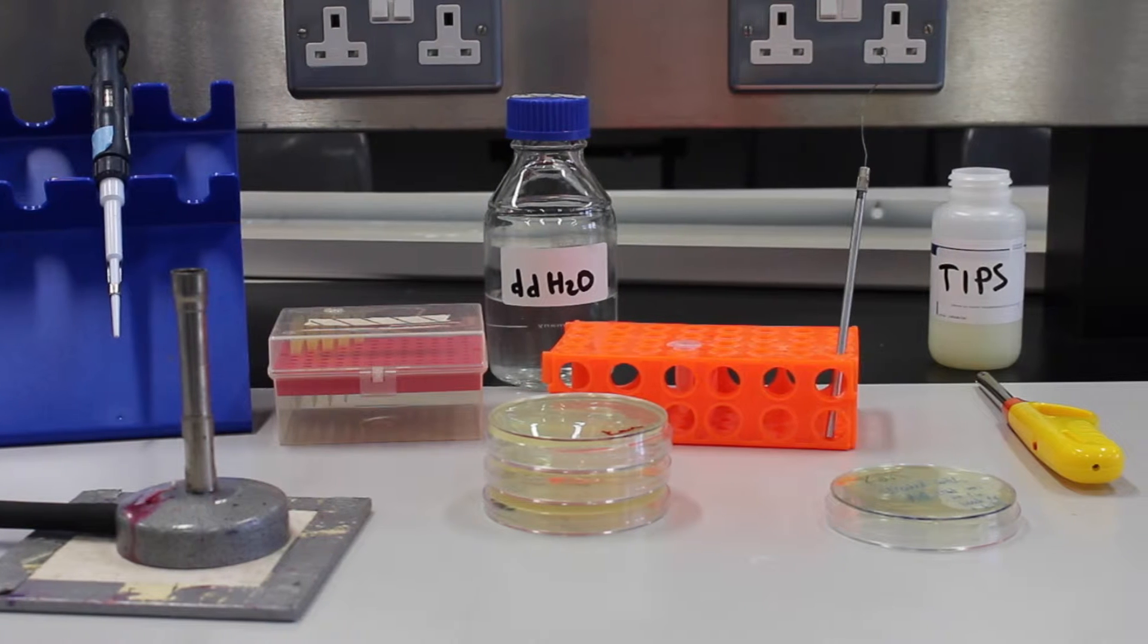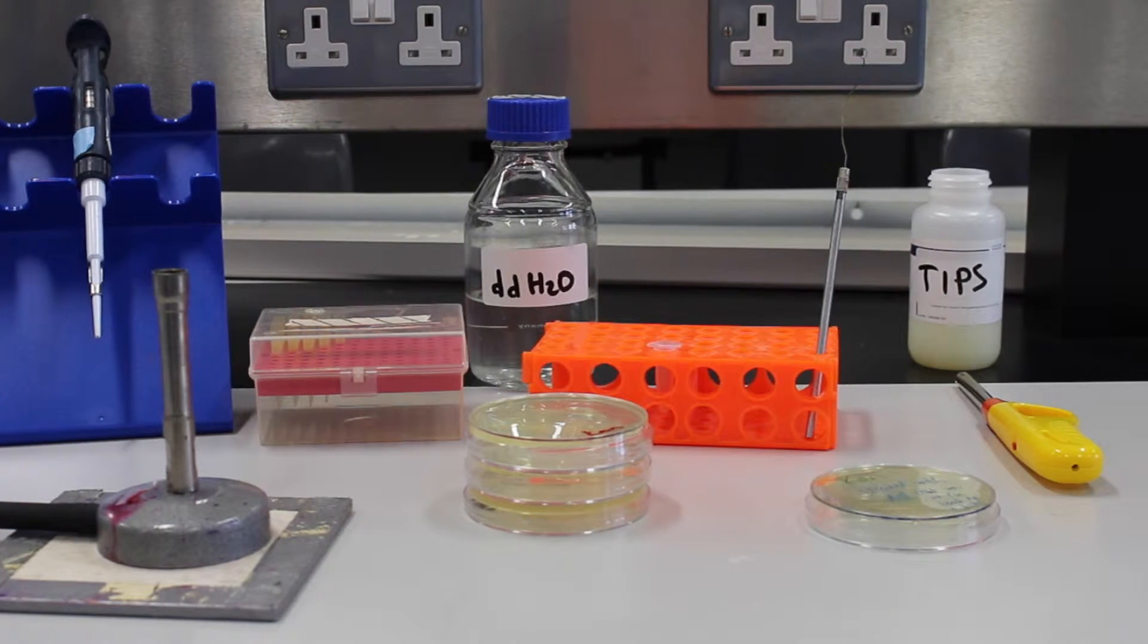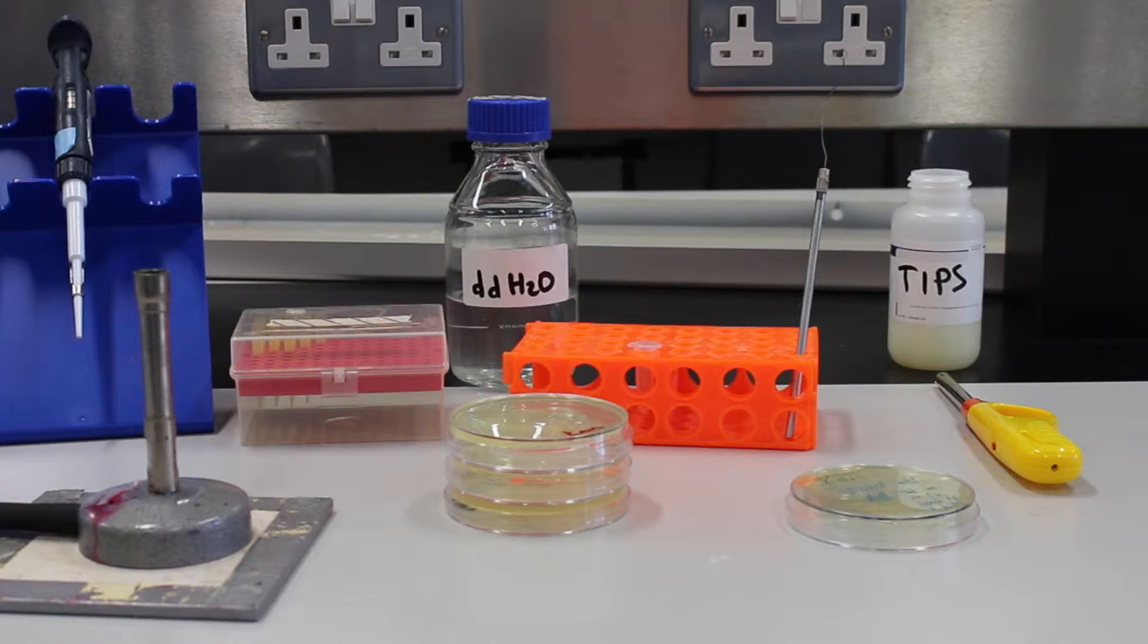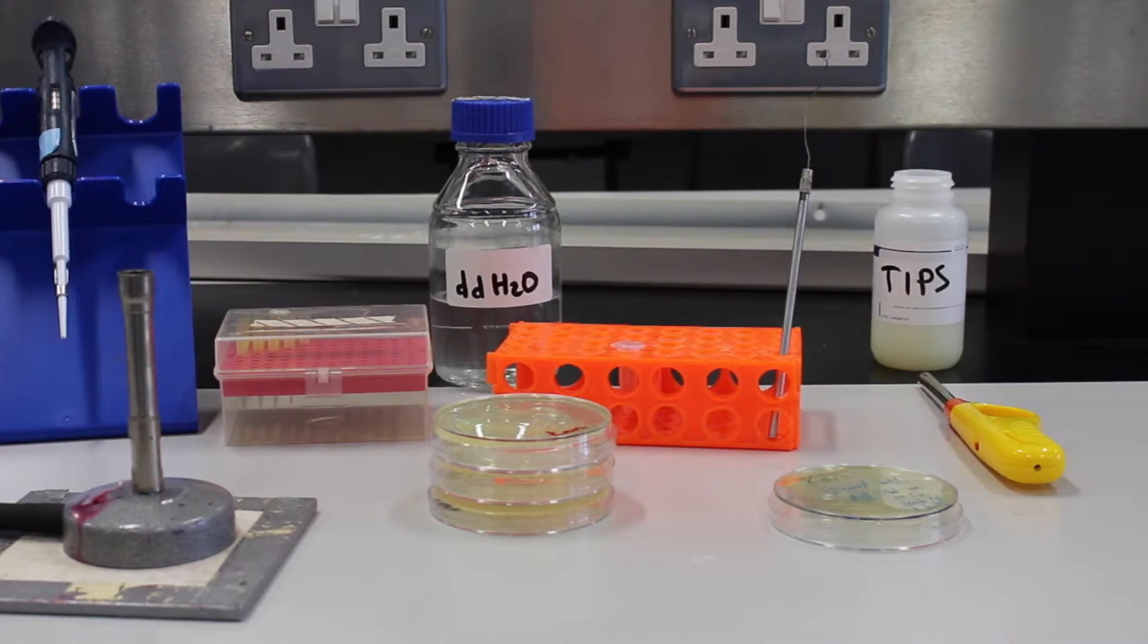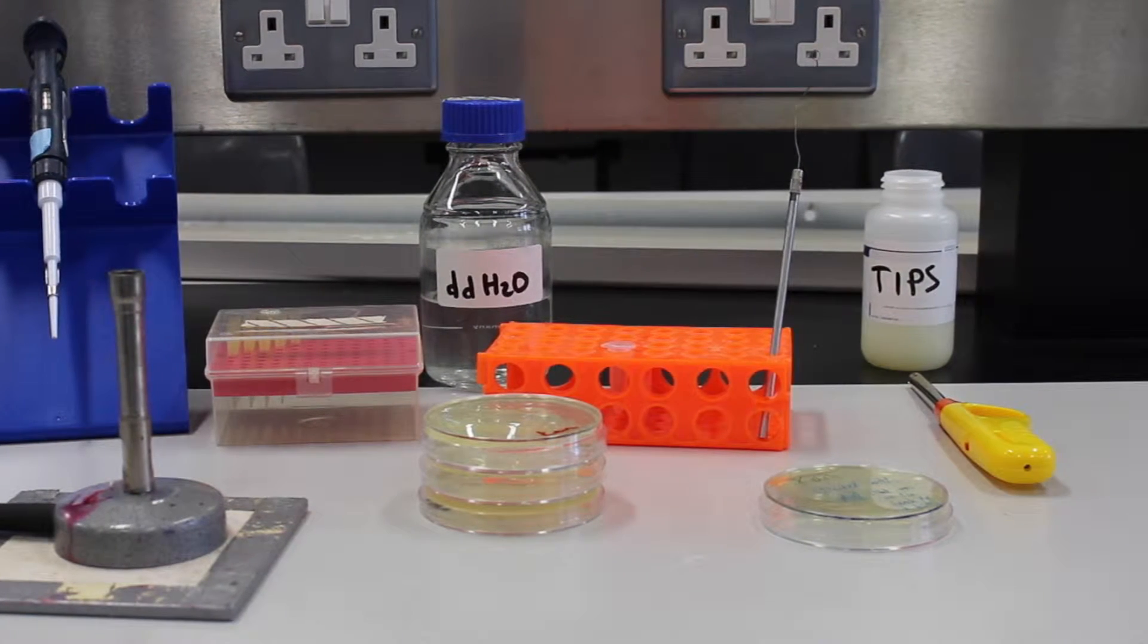Bacterial re-streaking is used to isolate a single colony. The following method eliminates so many cells that you can re-streak up to four different colonies on the same plate.